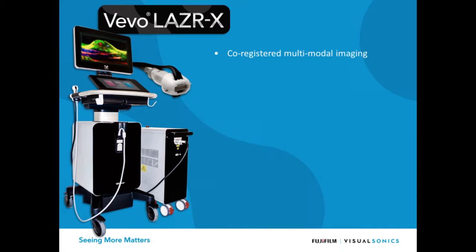LAZR-X. So this is really the next generation of photoacoustic imaging system, where we've taken all of the advantages of photoacoustic imaging and put them on the 3100 acquisition platform. We have some new things on here as well.